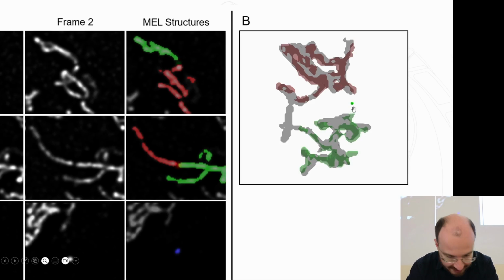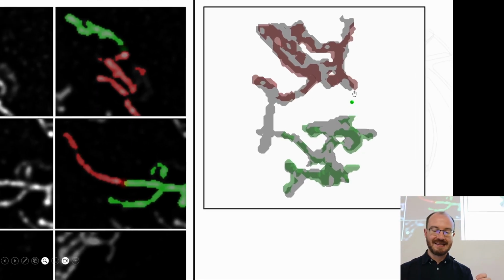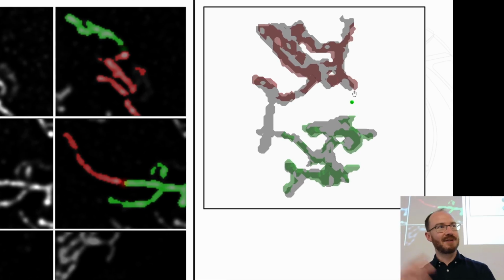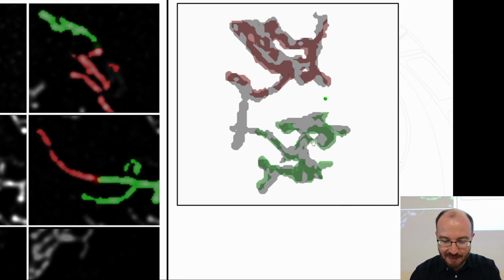Another issue that it had, which is, again, also now resolved in the latest version, these are instructive lessons, I hope, so that if you were to do things, there are some assumptions that you make which might not be valid, and that's what I'm trying to highlight here. So I've got two structures. They clearly fuse together in this third structure in the middle.